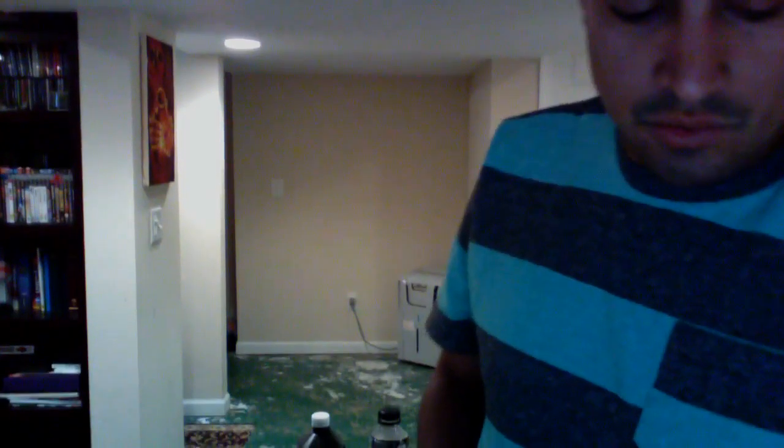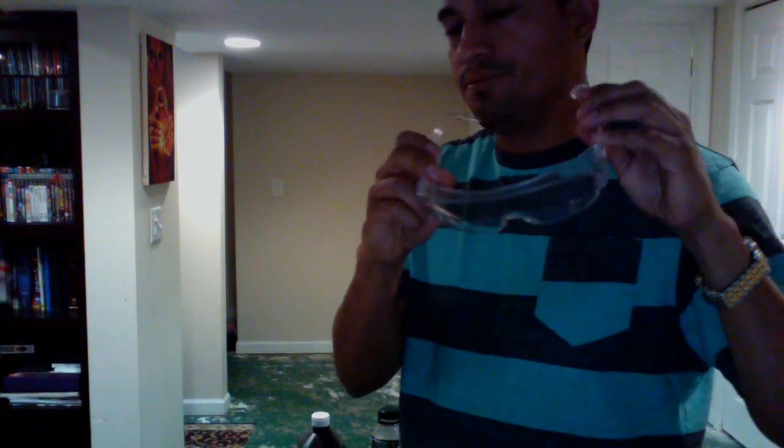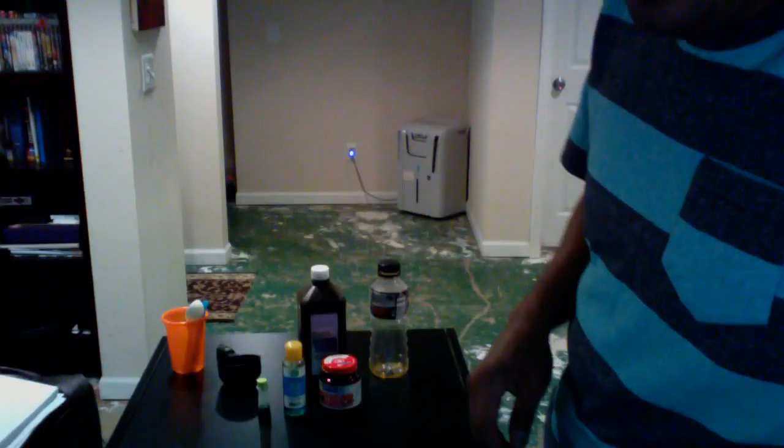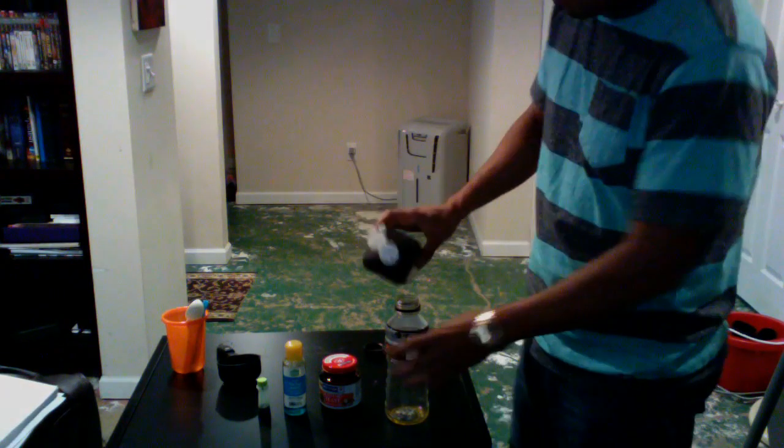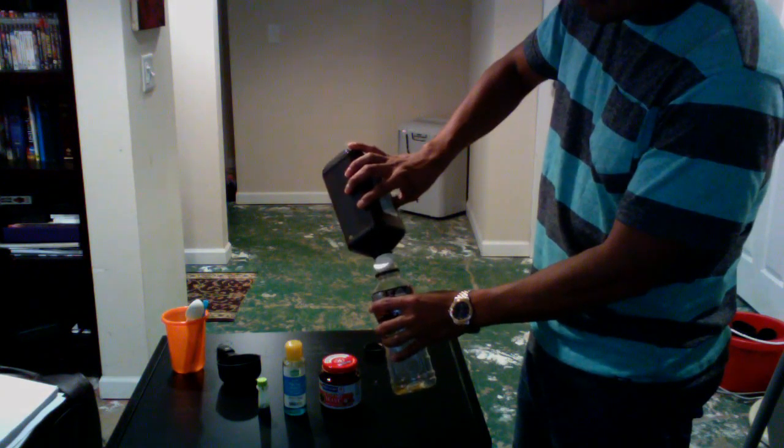So to do this experiment, first what we need to do is safety. Safety first. Always in a chemistry lab, you have to use protection. In this case, we're going to use this because we don't want any of the hydrogen peroxide getting into your eyes. So we open the bottle, and we're going to pour some hydrogen peroxide in there, as much as we can.